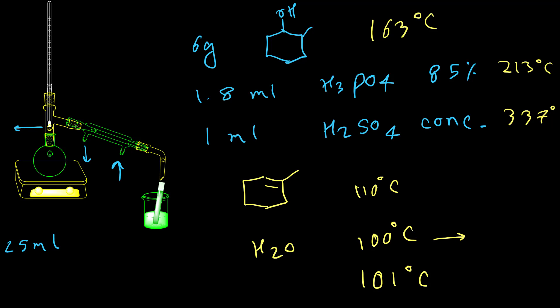For collecting the product, we need to put a centrifuge tube inside ice because the product is hot and also volatile. We want to cool it down to have higher percentage yields for our reaction. We collect it inside the centrifuge tube. When there isn't any more liquid coming from the round bottom flask to the tube, then we need to turn off the system and let it cool down. The remaining liquid inside the round bottom flask can be dumped to waste.